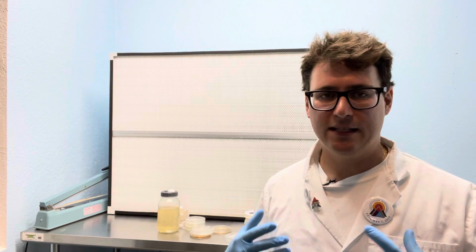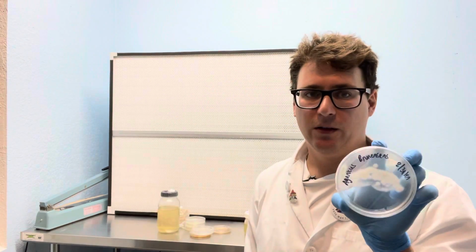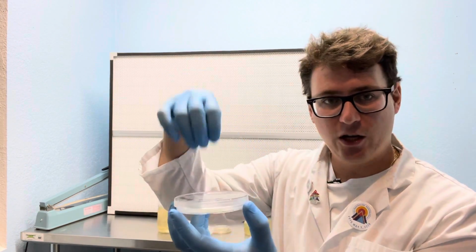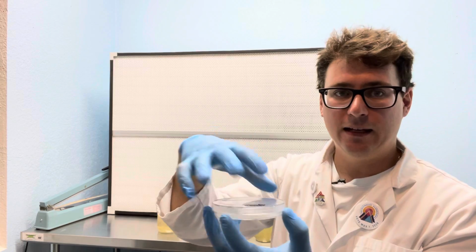So I guess the next difference between the two is the rate of contamination, or the liability of contamination. When you're utilizing an agar culture, you have to be in front of a flow hood. The opening of this vessel is going to be big enough that any dust or debris from your skin can cause bacterial or yeast or mold colonies to land on the surface and then out-compete the mycelium culture. So in order to do that, you have to maintain proper aseptic technique.